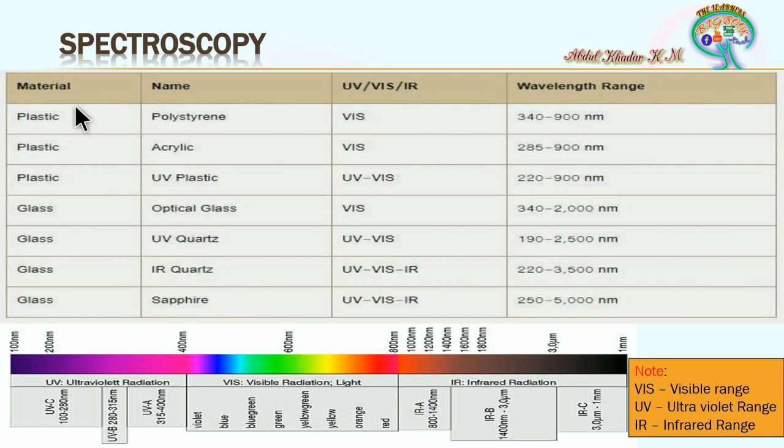Now cuvettes differ by their material, like plastic and glass. Plastic cuvettes are used once. Glass cuvettes can be used multiple times.